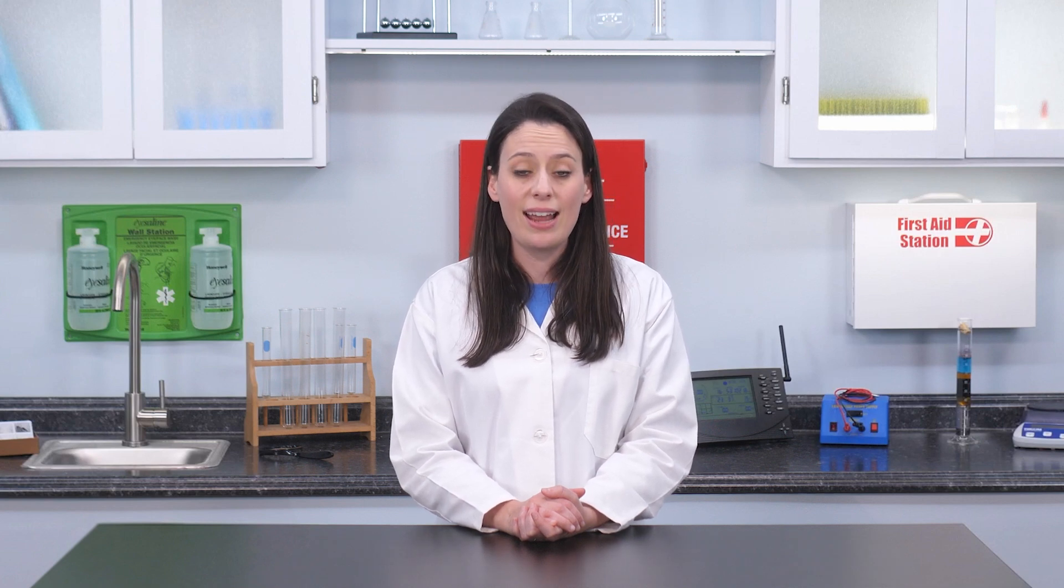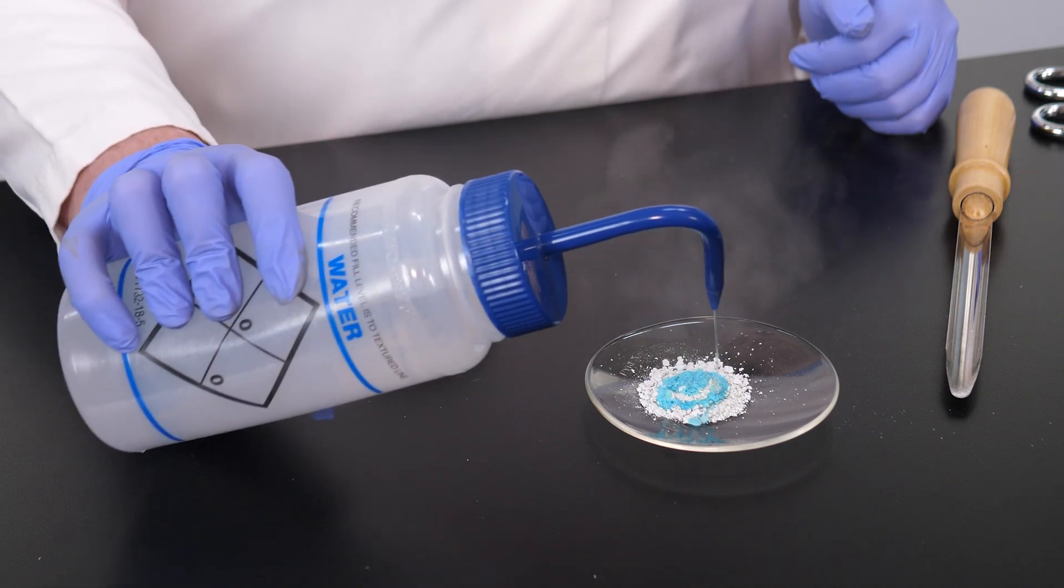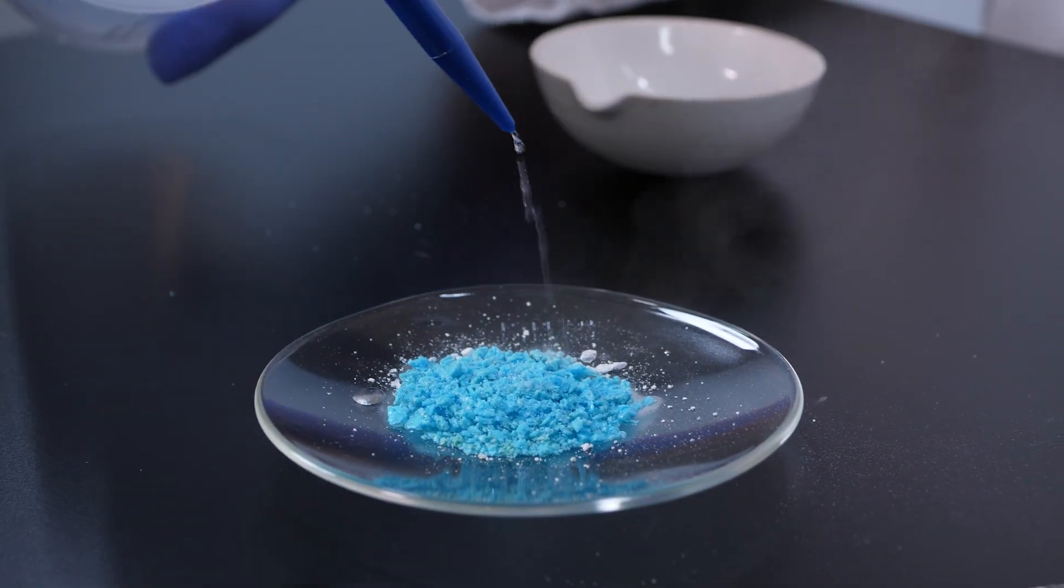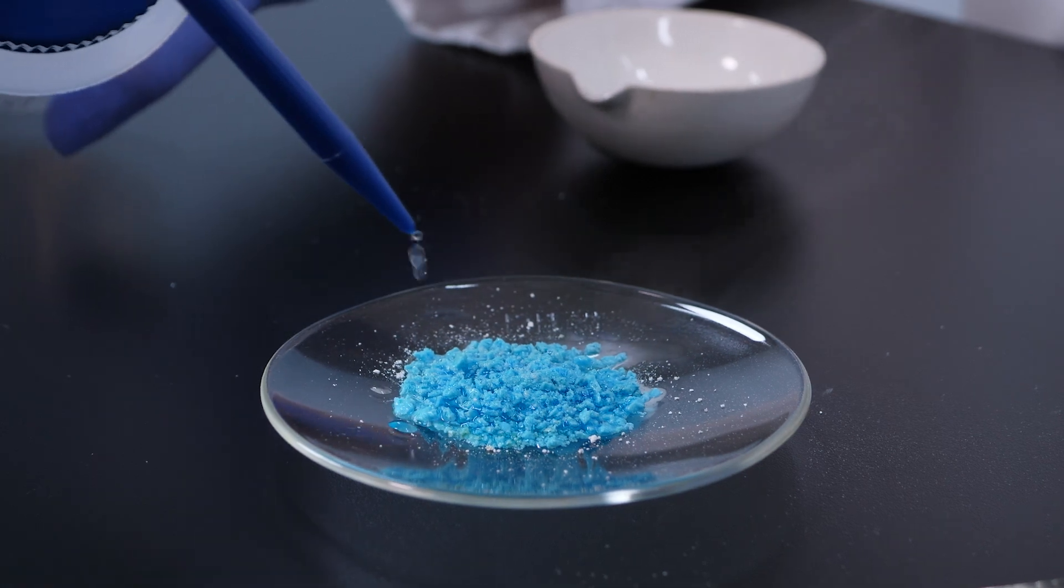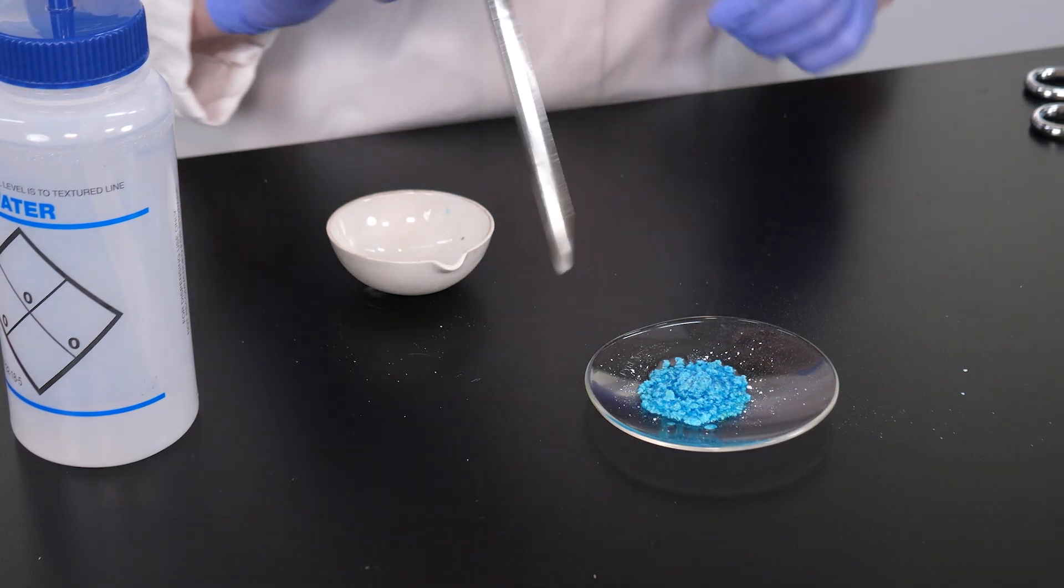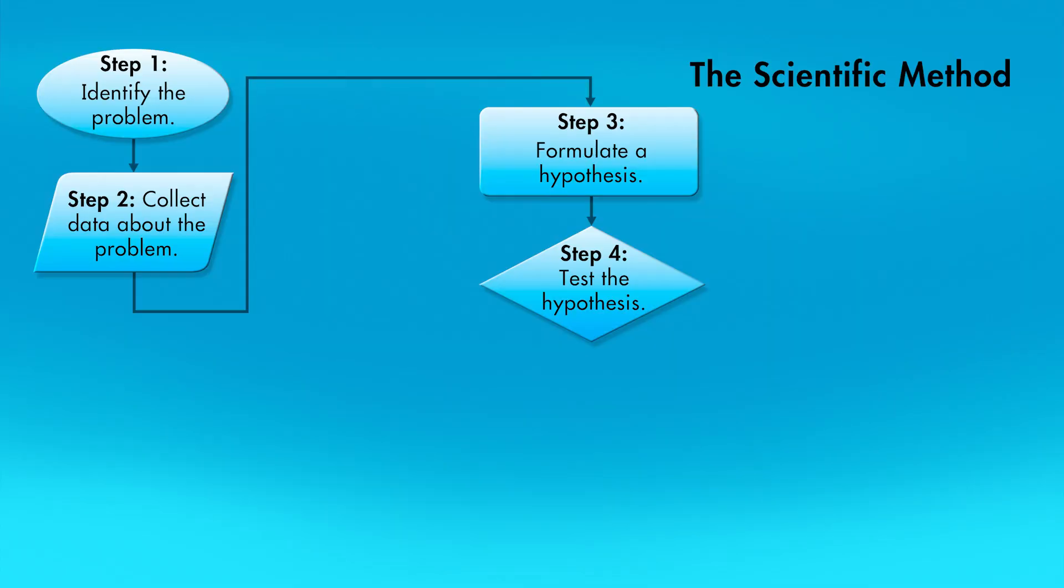To be absolutely certain this is anhydrous copper sulfate, we should perform one final test. We will rehydrate the crystals by adding water back into the anhydrous copper sulfate. By adding water to the white, anhydrous substance, the crystals turn blue again. From our research, we learned that copper sulfate is the only compound that turns blue when it is hydrated, which supports our hypothesis that this is, indeed, copper sulfate pentahydrate.